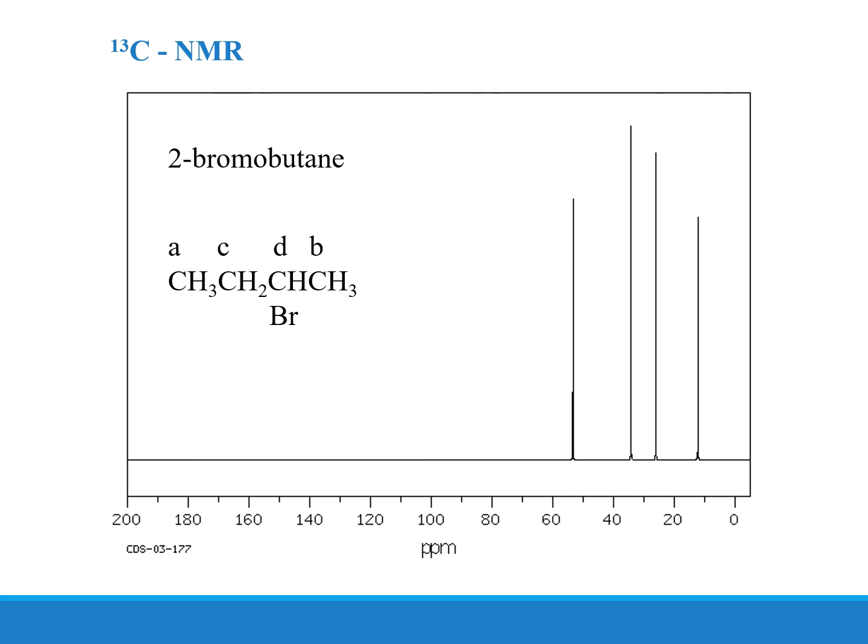The first carbon atom, as you can see, labeled D, will have high electronegativity influence, whereas the methylene and the methyl group will have similar electronegativity influence, but because the carbon atom in C is further bonded to another methyl group, it will appear with a different radio frequency in the NMR machine, and will have a separate peak from the carbon seen in B.